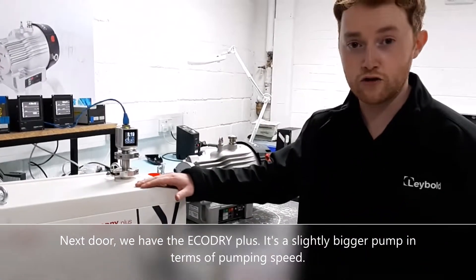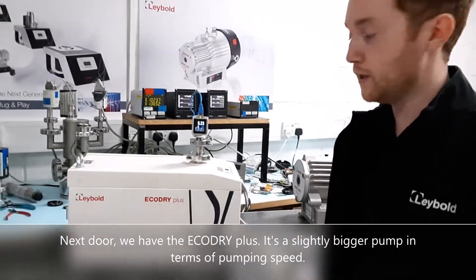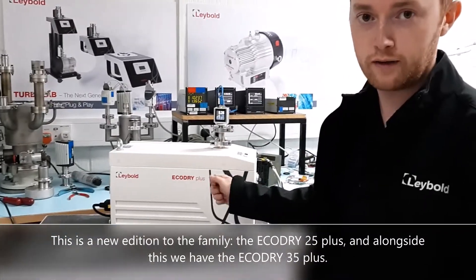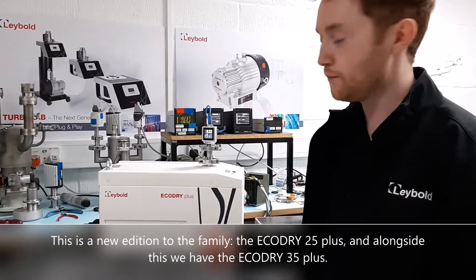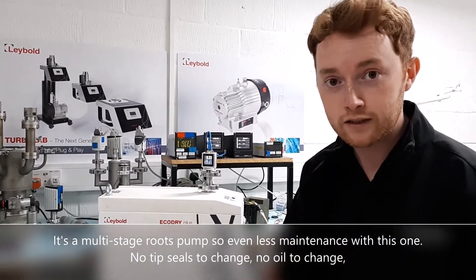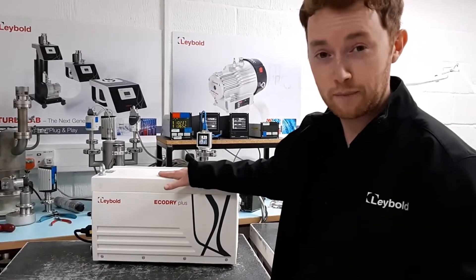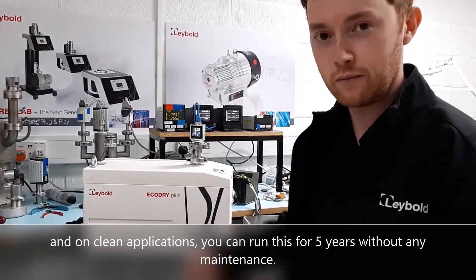Next door we have the EcoDry Plus — it's a slightly bigger pump in terms of pumping speed. This is a new addition to the family, the EcoDry 25 Plus, and alongside this we have the EcoDry 35 Plus. It's a multi-stage roots pump, so even less maintenance than the scroll. No tip seals to change, no oil to change, and on clean applications you can run this for five years without any maintenance.